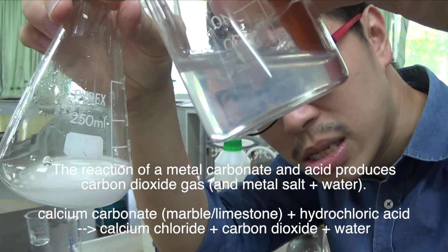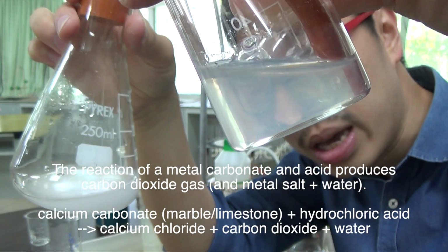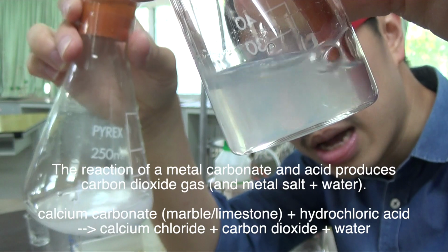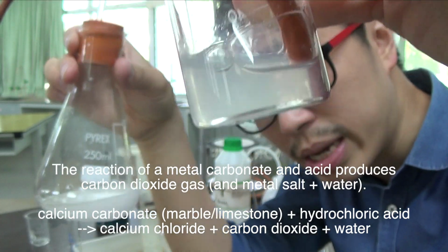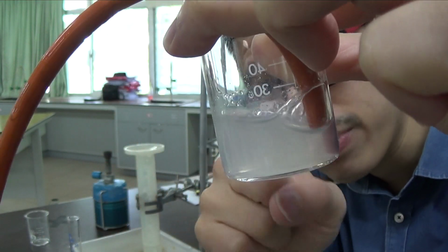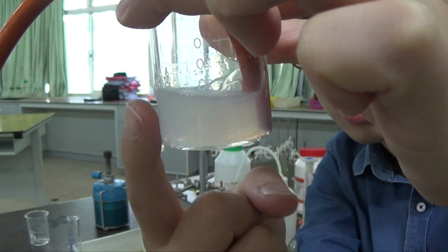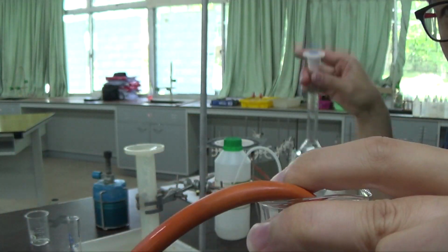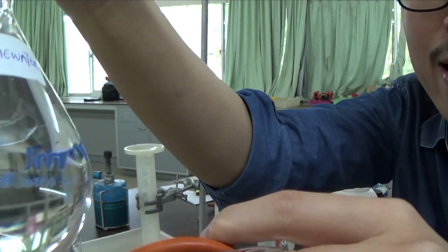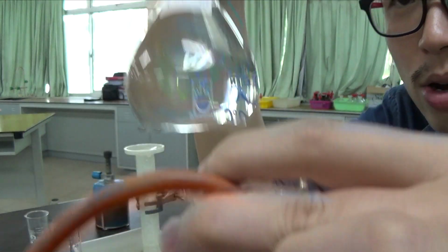Look what happened to the lime water. The lime water slowly turns cloudy. The lime water slowly turns milky. Just now it was a colorless solution. The gas is bubbling. The gas is colorless, but what you see is you bubble the gas through lime water, and what happened to the lime water? The lime water turns milky or cloudy. Just now it was colorless lime water. Lime water is used to test for carbon dioxide.